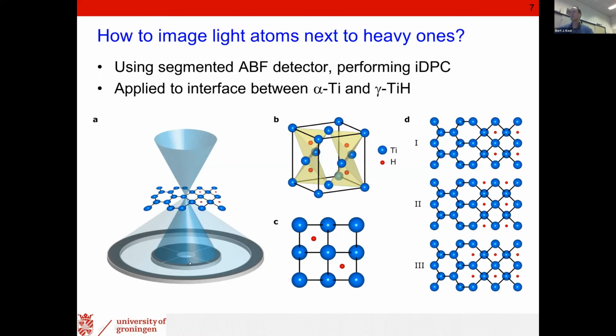However, if you do that, you come back to a kind of normal TEM imaging where you have all kinds of wave interferences, and then it becomes very hard to be sure with wave interference whether you really image atoms, or whether it's just a subsidiary maximum of a wave. And this is very crucial, to be sure that you see really atoms and not wave effects. So we want to get rid of the wave effects and see again really the phase of the sample, and not all kinds of phase reversals which can happen in normal TEM images.